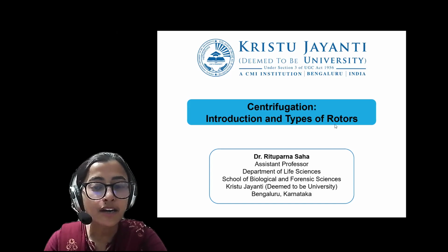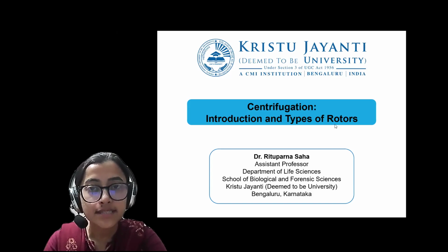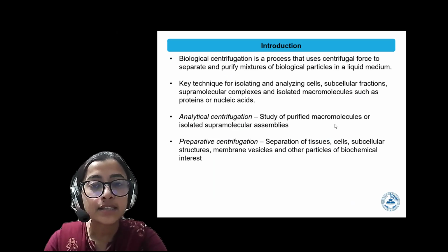Today, I will be discussing a fascinating topic: centrifugation, introduction, and types of rotors. Centrifugation is a fundamental technique widely used in biological sciences, especially in biochemistry, molecular biology, and biotechnology. It plays a crucial role in separating cellular components and macromolecules based on their physical properties. Let us begin with an introduction to centrifugation.